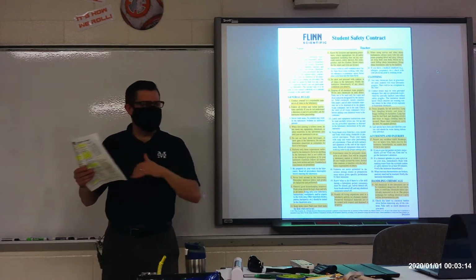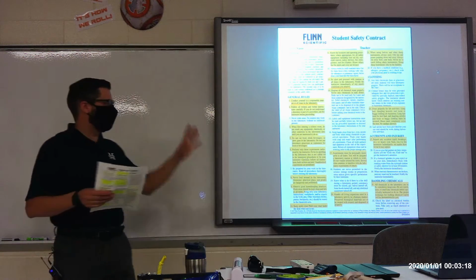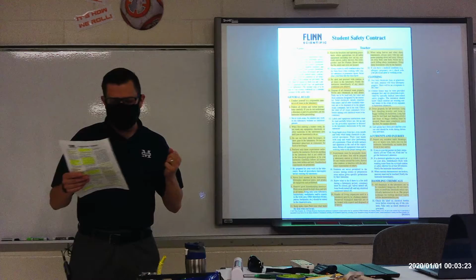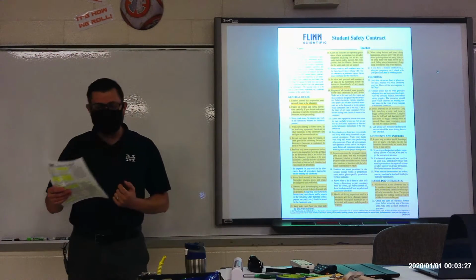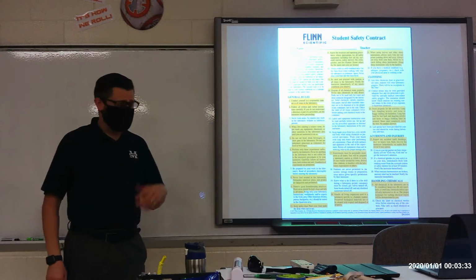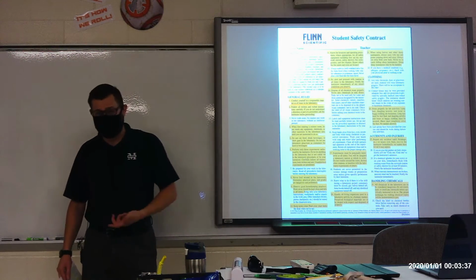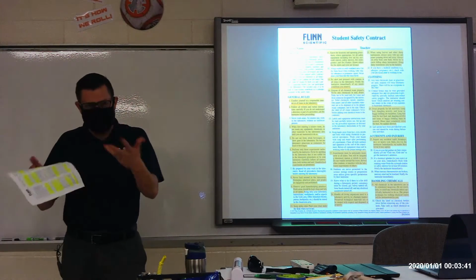Now, as we're going through, highlight the important items. I have some of them already highlighted here. Under general rules, number 1, it says, conduct yourself in a responsible manner at all times in the laboratory. Basically, when we are doing lab activities in this class, the purpose is so that we can learn something from that activity. There's something to be said about doing things in person.